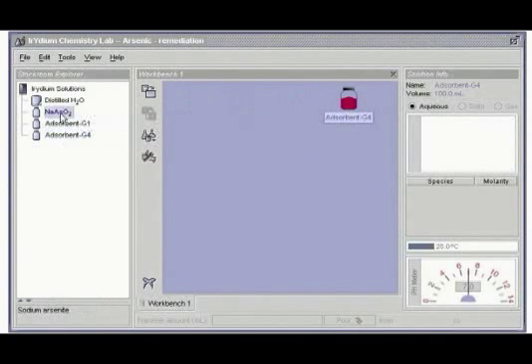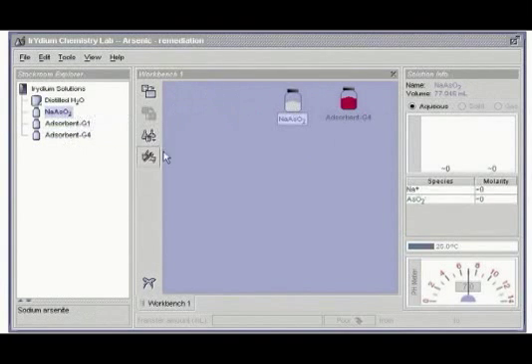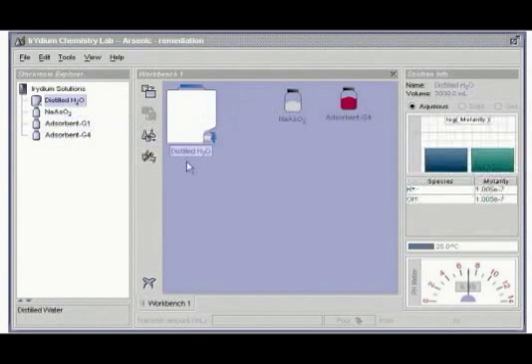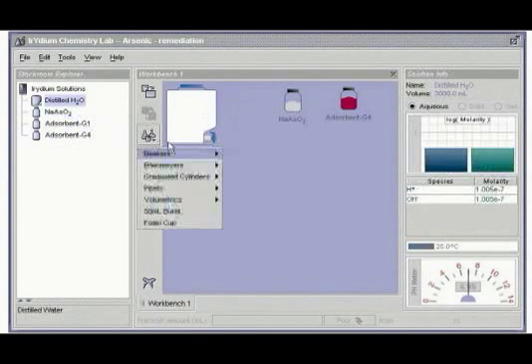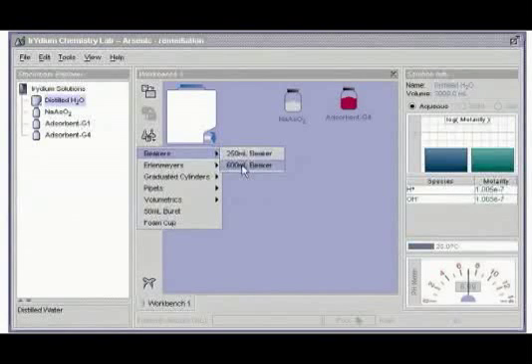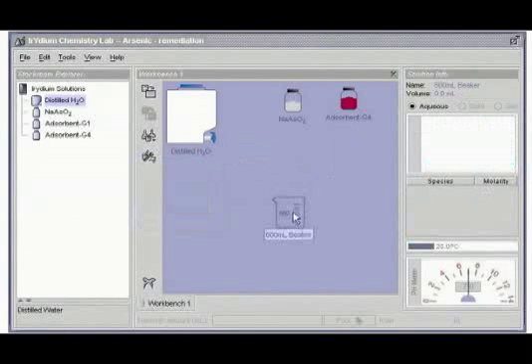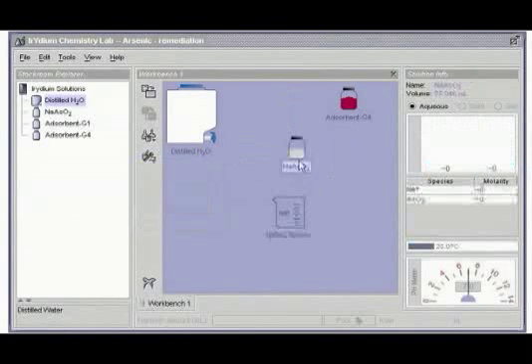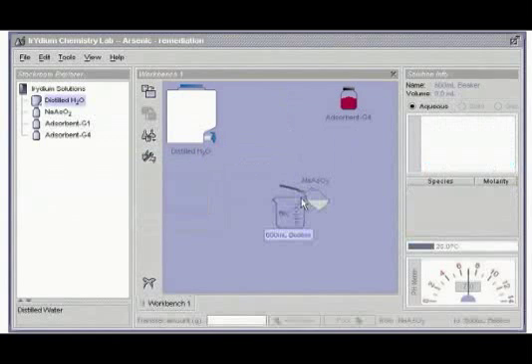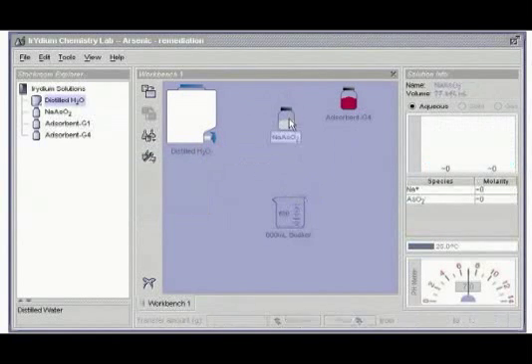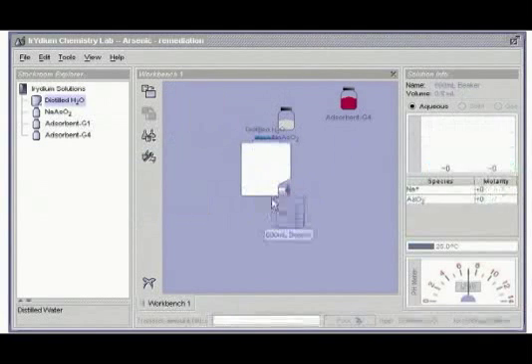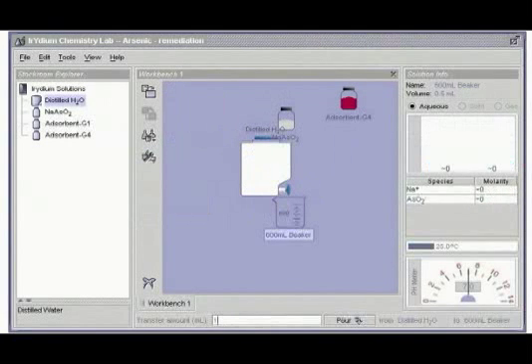To demonstrate this, let me make a solution of sodium arsenite, which I'll do in a large beaker, a 600 milliliter beaker. I'll add 1 gram of sodium arsenite and 100 milliliters of water.